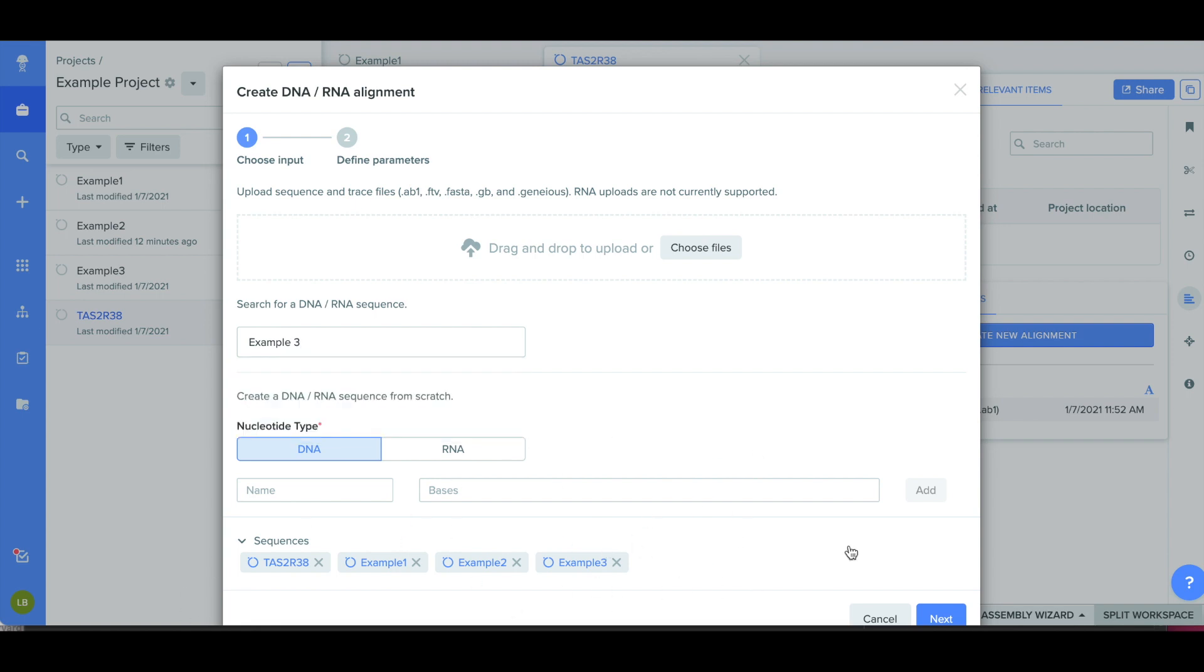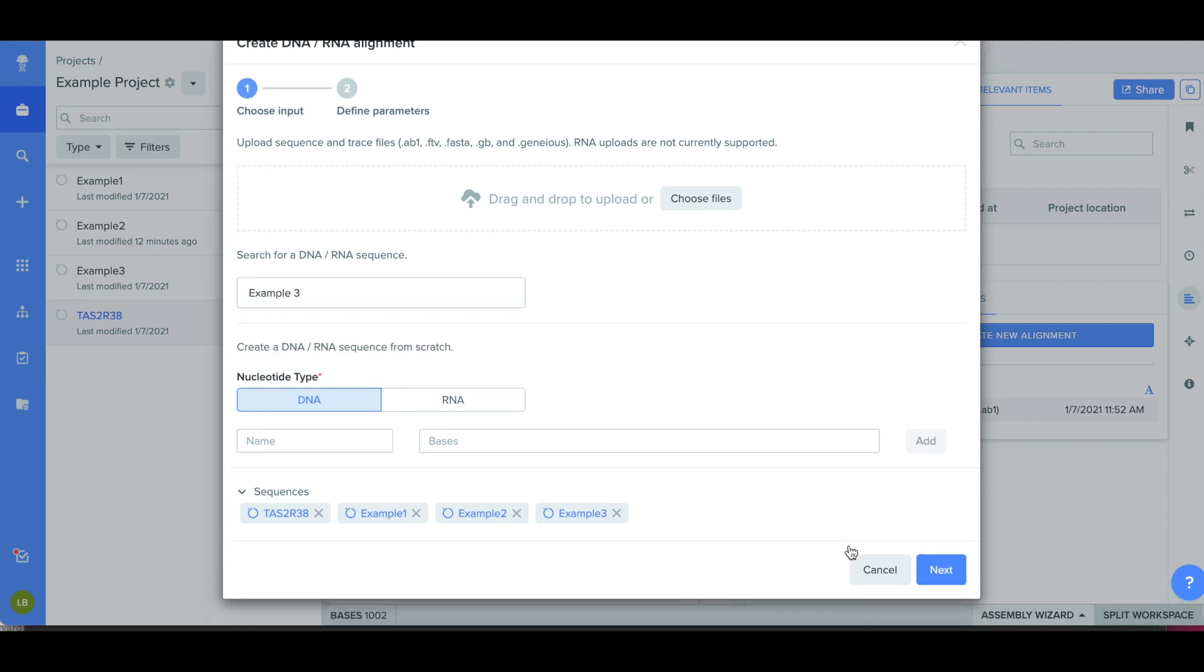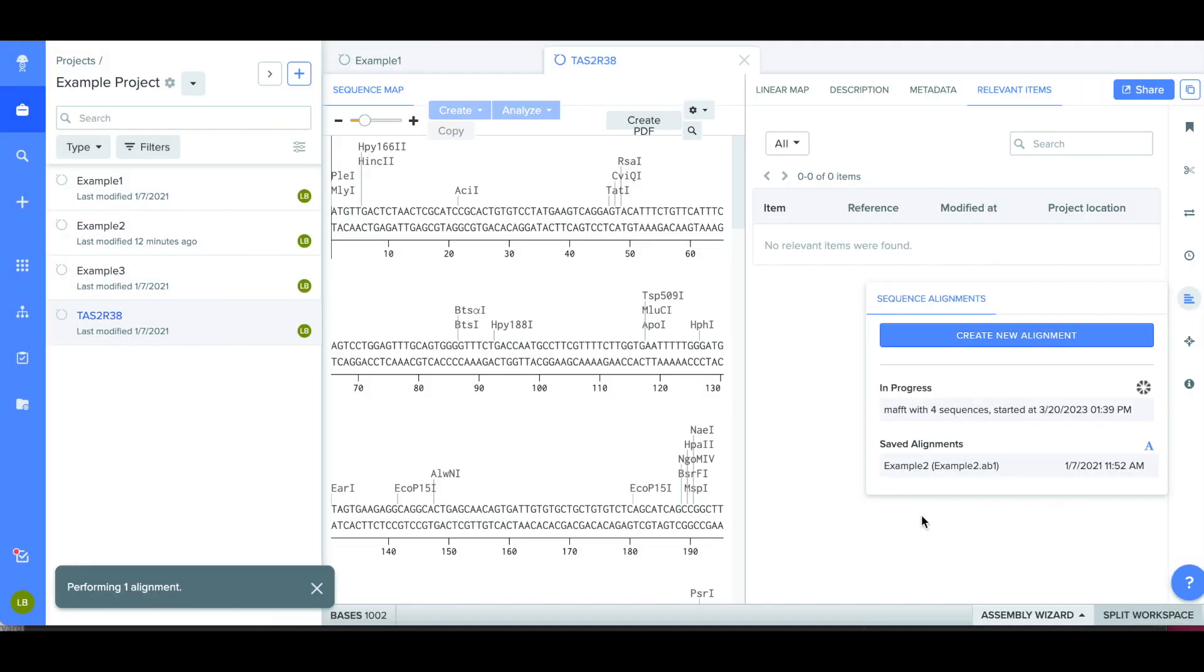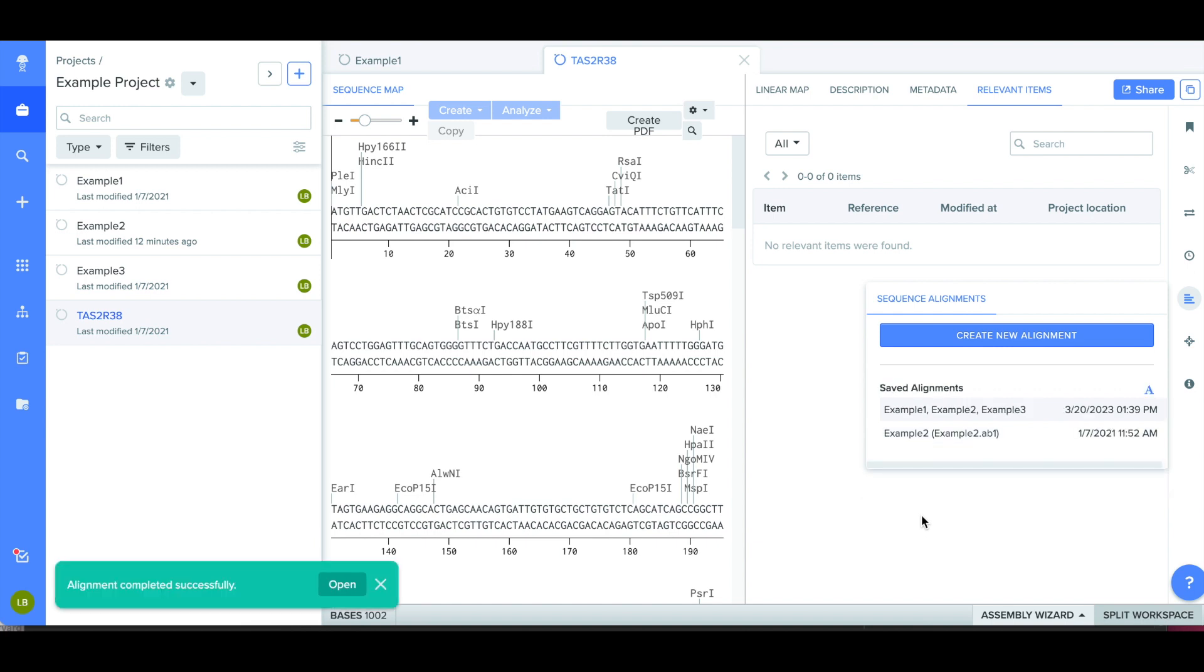I then click Next and then click Create Alignment in the next window. It sometimes takes a minute to perform the alignment, but then you can push the green button in the bottom left corner of the screen.